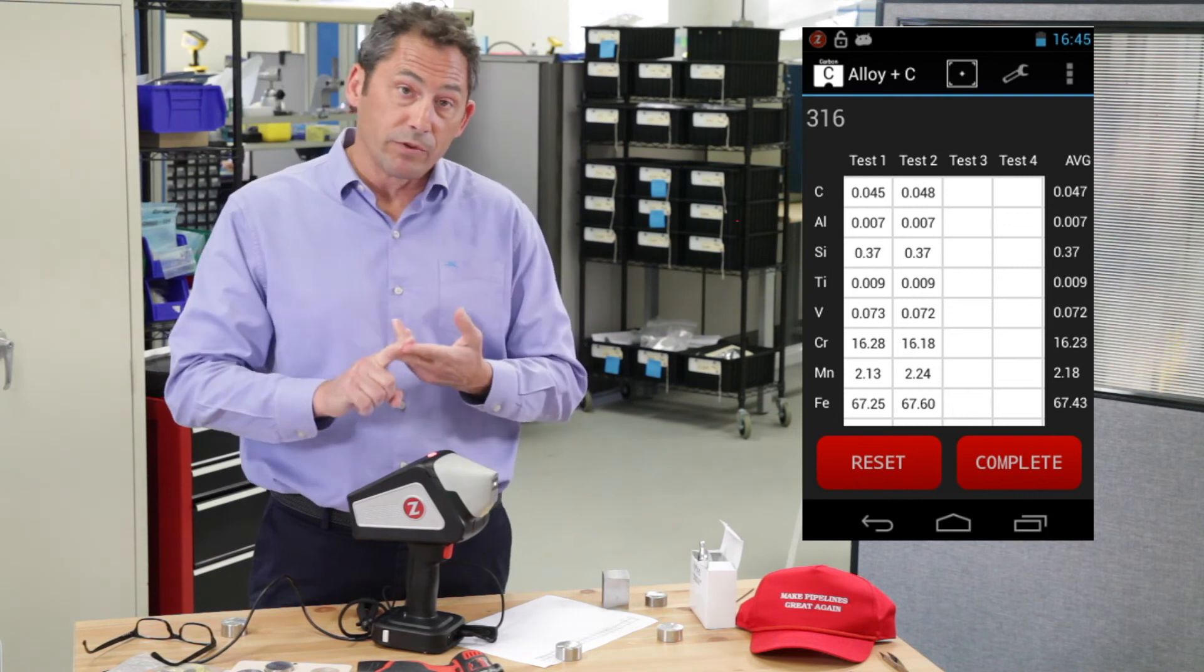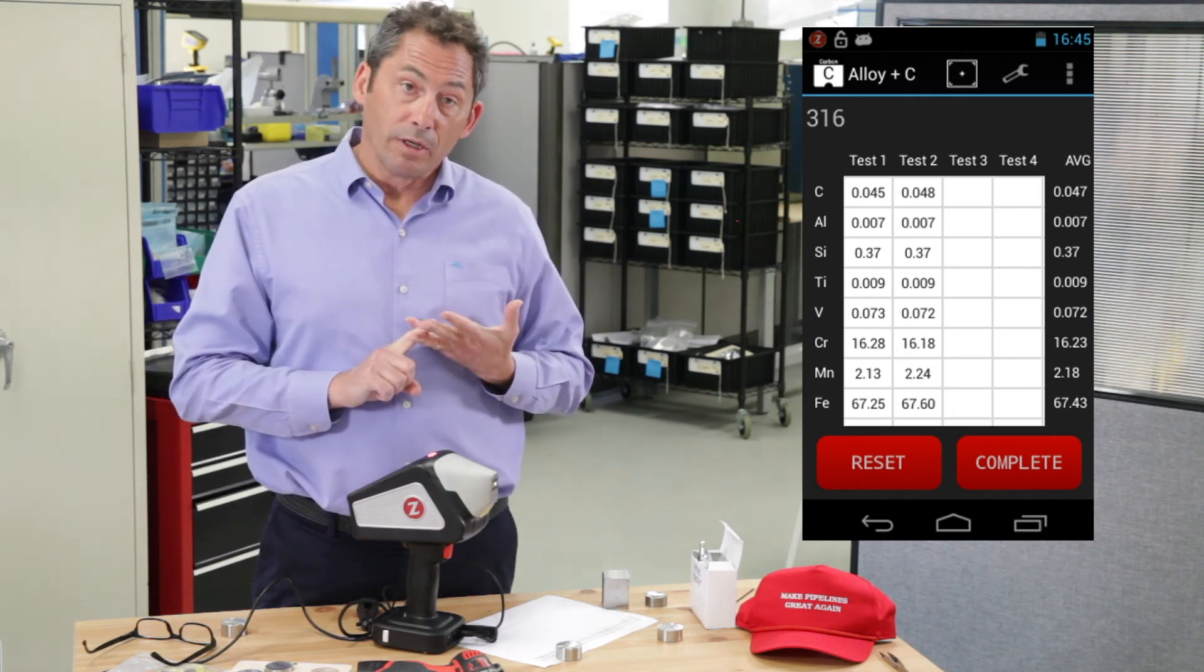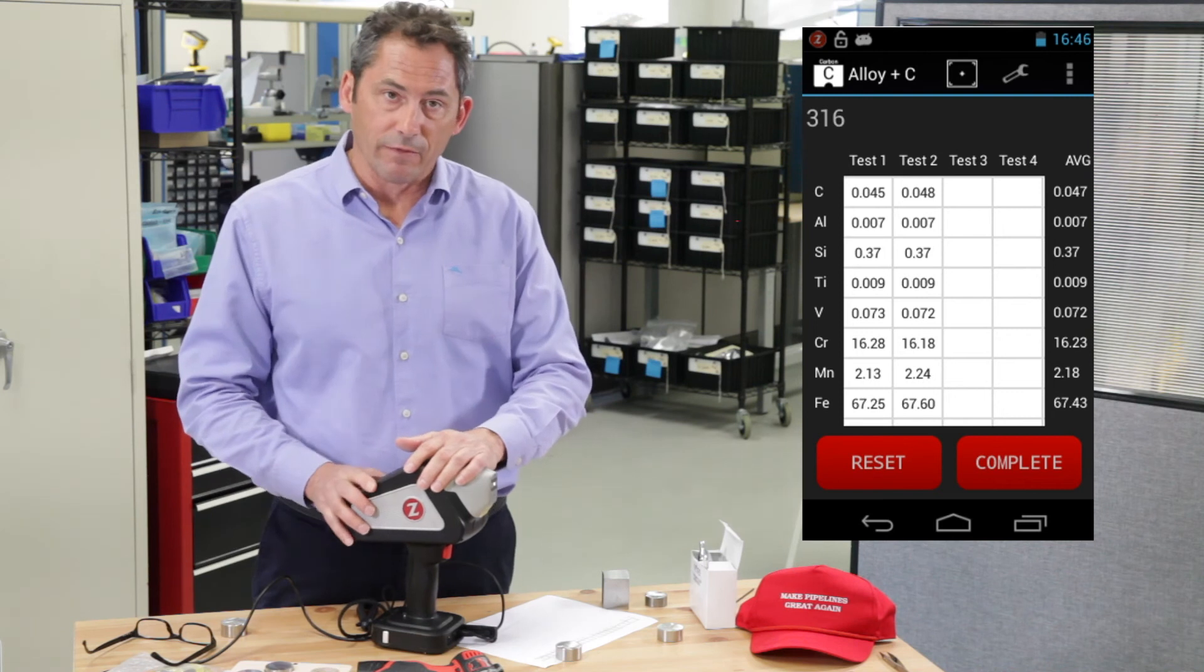So faster tests, more precision, less argon consumption, all means more productivity. It's already a very productive analyzer.